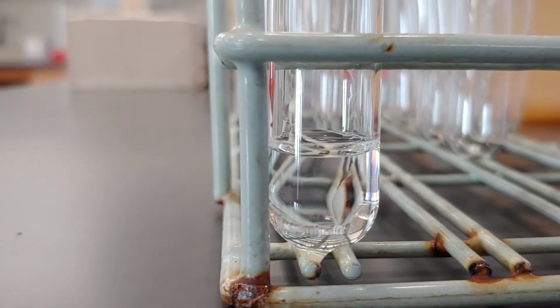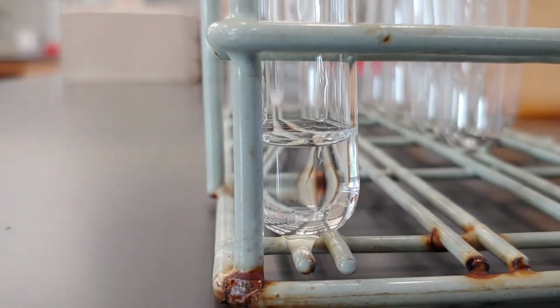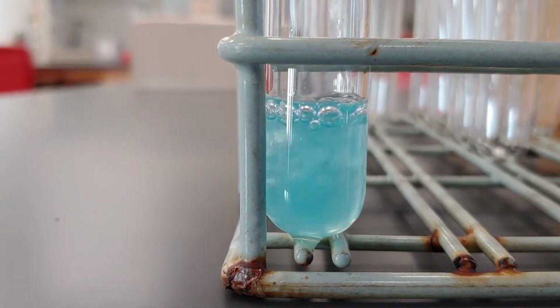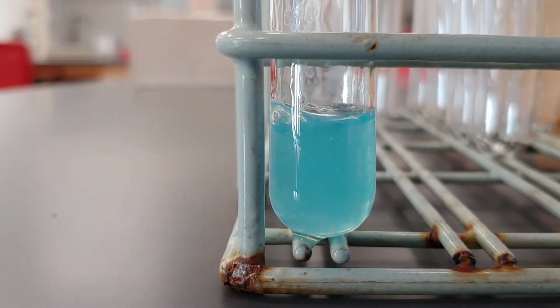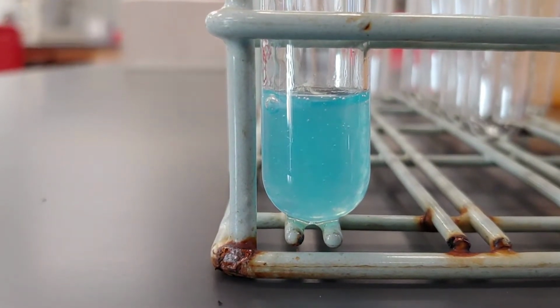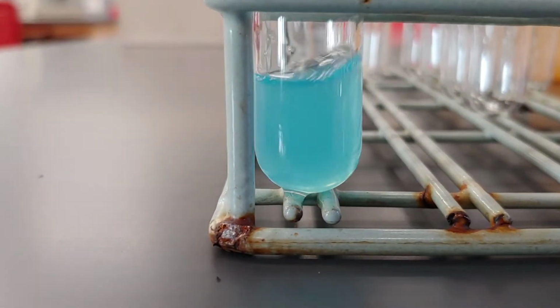All right, this is reaction number 3. In the test tube, I have aqueous sodium phosphate, and to that, I'm going to add aqueous copper(II) sulfate. There is sodium phosphate and aqueous copper(II) sulfate, and it's the lovely, what we like to call Smurf blue.